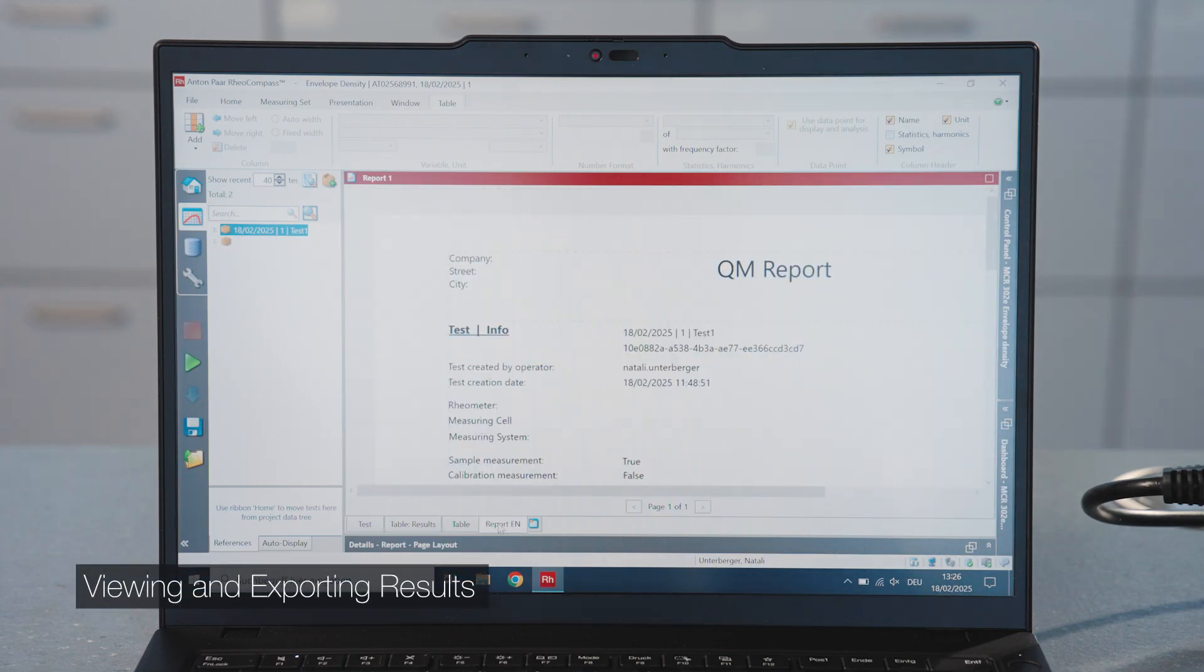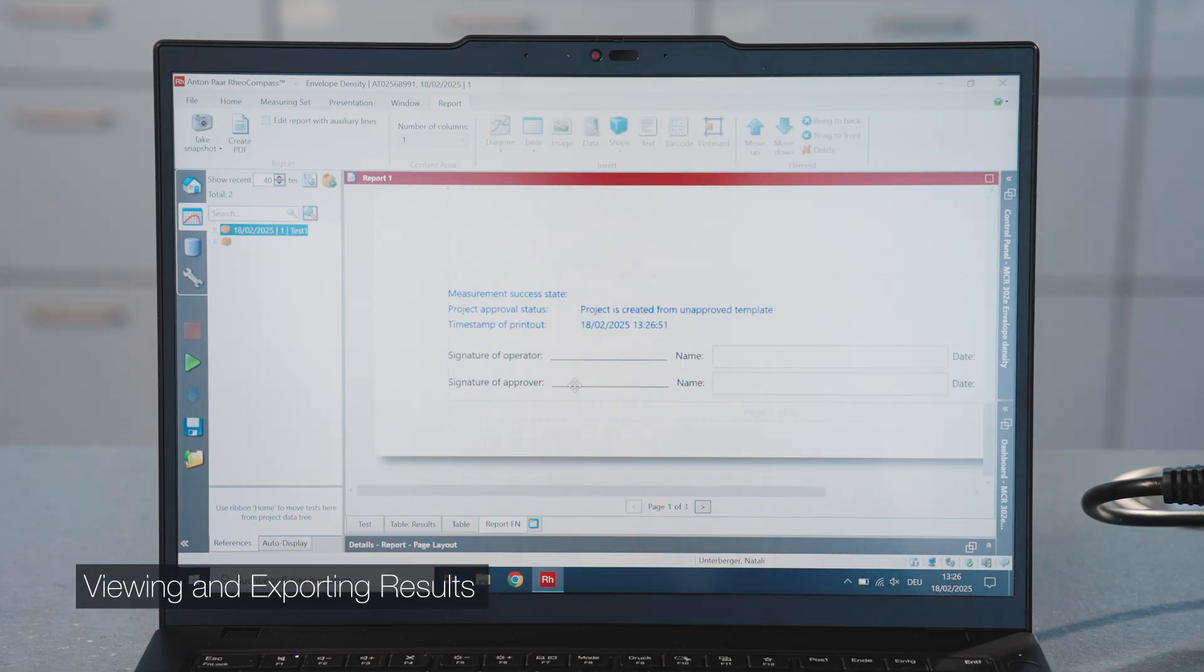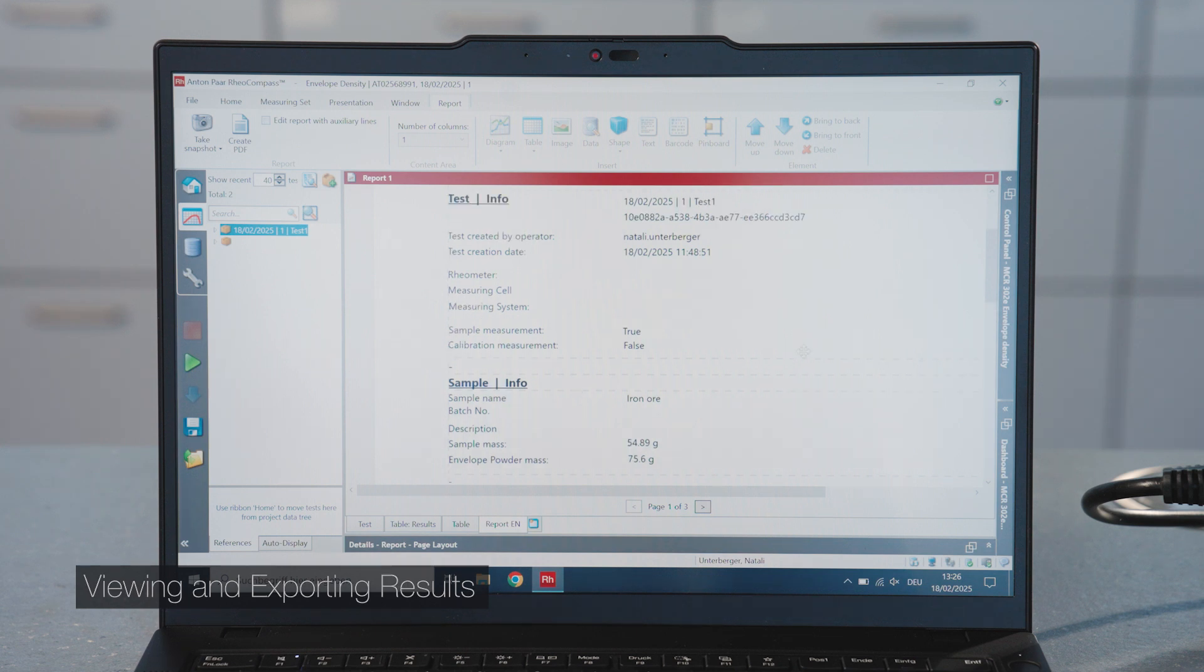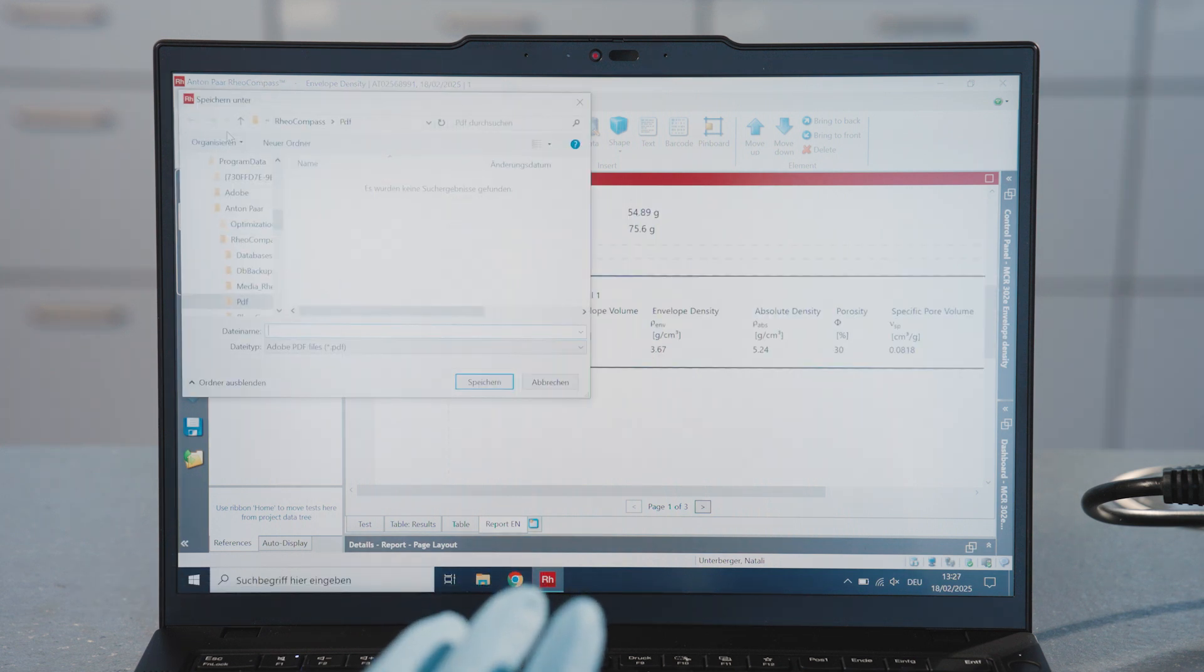The measurement report contains all information on the measurement setup and the automatically calculated measurement results. Export the results in PDF format or simply save the measurement in the software or on the PC.